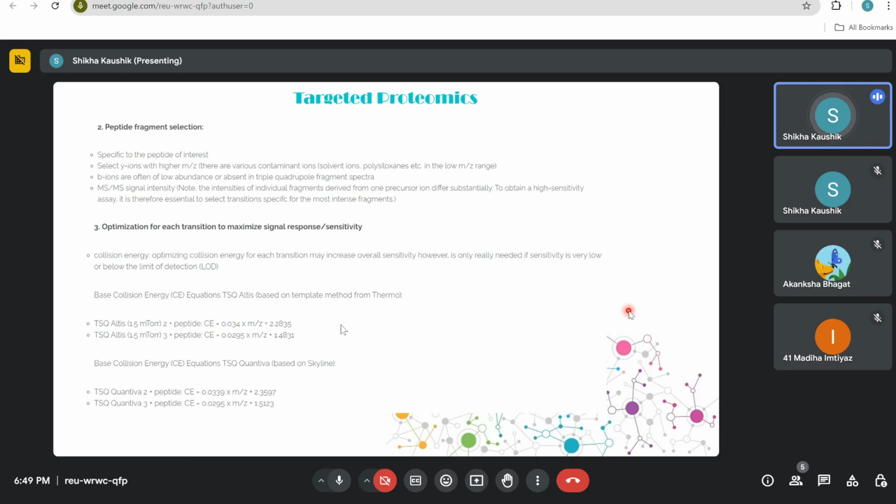So basically you need to gather as much information on your selected peptide, so that whenever things go wrong you may check all these things. For example, you need to understand the collision energy, especially when you are studying low abundant proteins, in which case you need to pay more attention to these things.